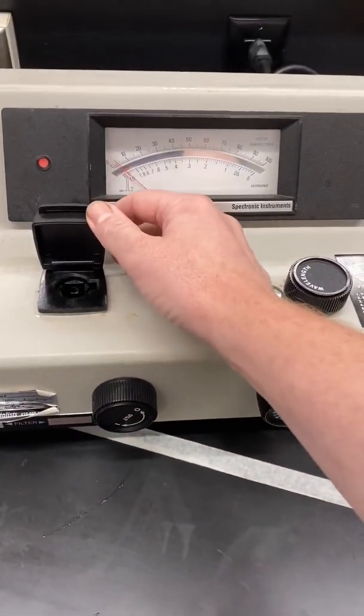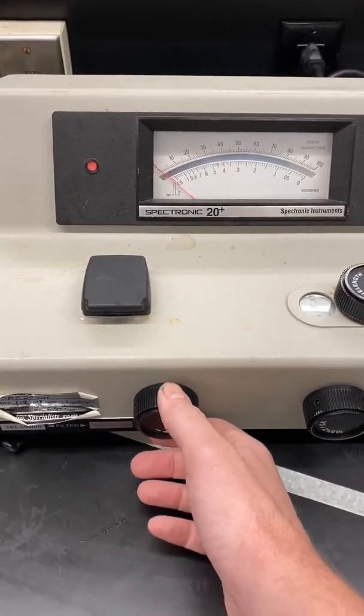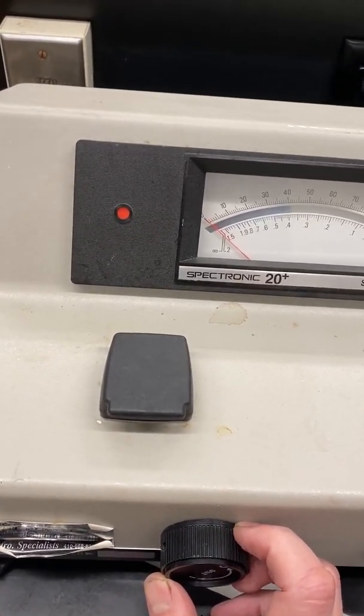Then, with nothing in the sample compartment but the compartment lid closed, use the left knob on the front to set the percent transmittance reading — which is the top scale — to exactly zero.